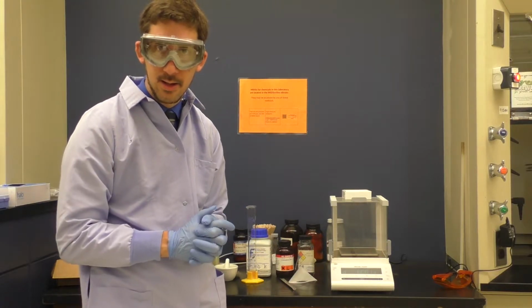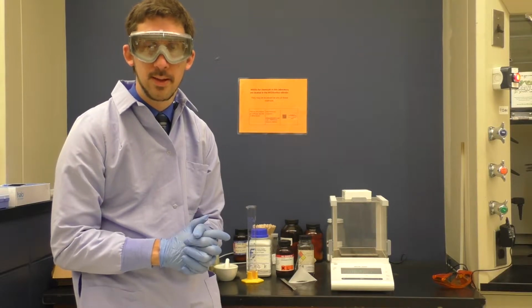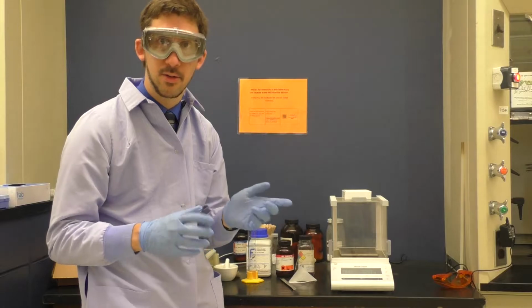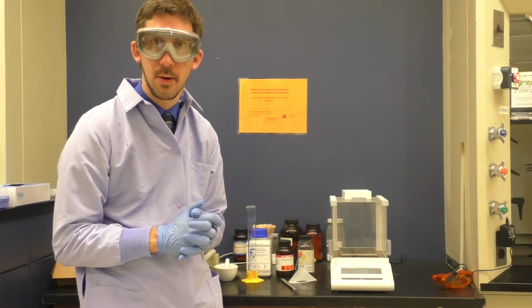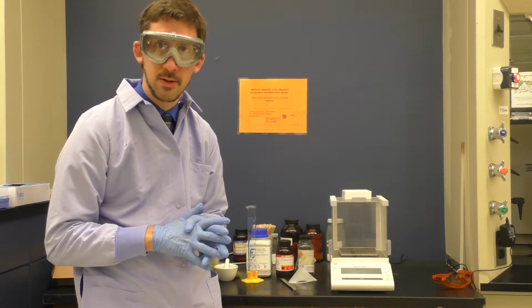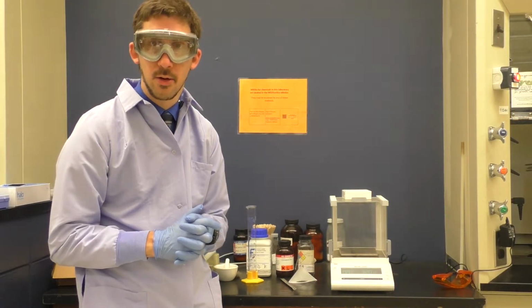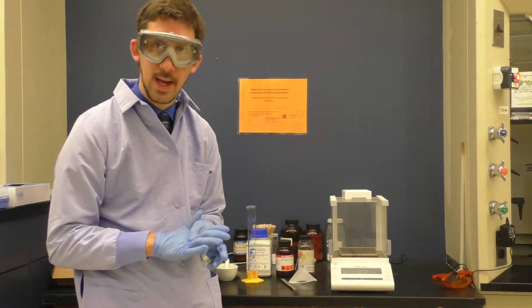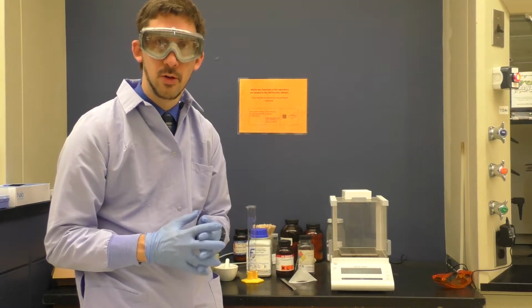Well, the reason that it's black is because 4-aminophenol is very electron rich because of the hydroxyl and amino groups, and it tends to react with itself to form polymeric impurities that are highly colored. So the first thing we have to do in this reaction is remove those colored polymeric impurities. To do that, we'll weigh out 2.5 grams of our 4-aminophenol. We'll dissolve this in water.